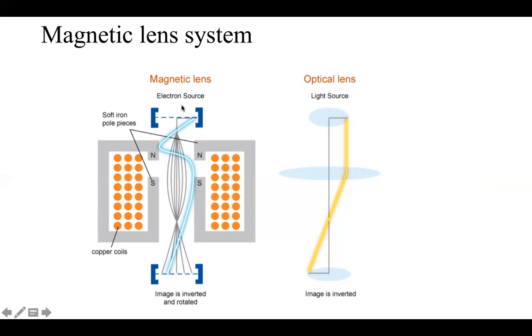Okay, so this electron beam, we can control it. We can focus it onto the sample. Then the outcoming electrons will again be focused onto the detector using a projector lens, which is another sort of electromagnetic lens. So this is a schematic showing you how optical lenses work, and this schematic shows you briefly how an electromagnetic lens is used to control the electron path.